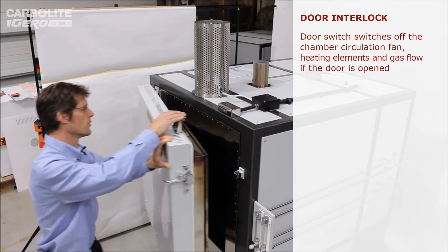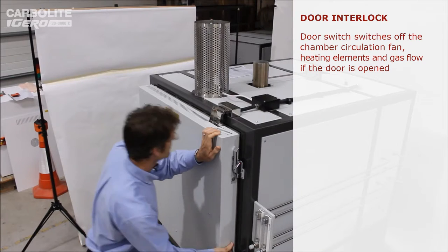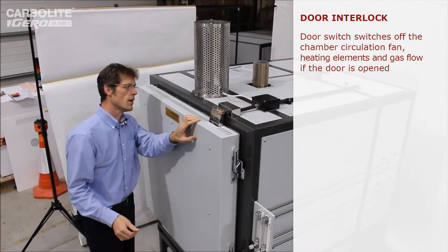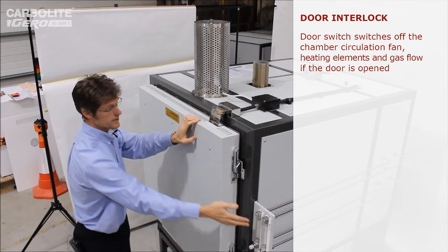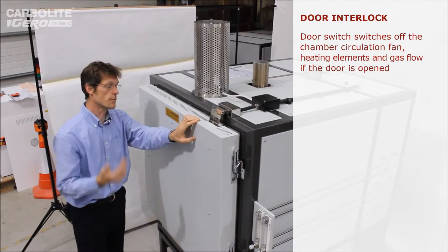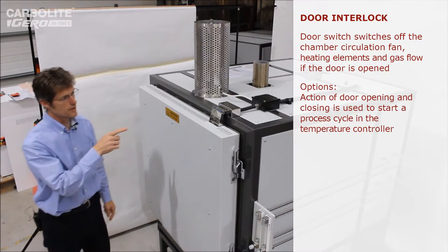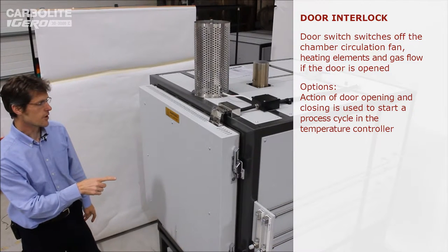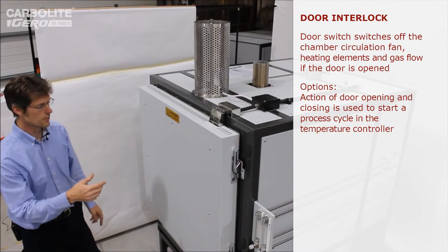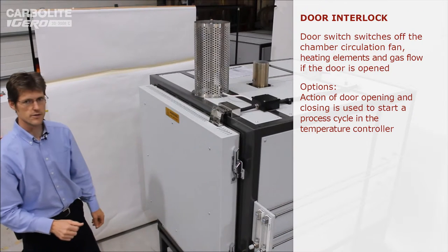This feature on top of the door is a switch which detects when the door is open or closed. It's normally used to turn off the heaters, fan, and in this case the gas as well when the door is open. In this oven we've also used it as a trigger to the controller to start the heat cycle so the program can run a continuous loop — the customer just has to open, load, close the door and the next cycle starts automatically.